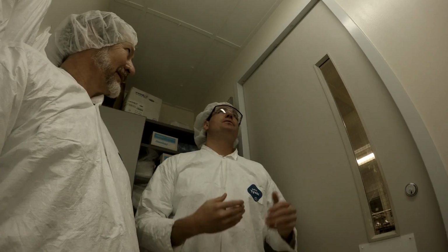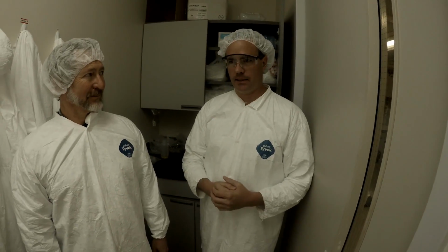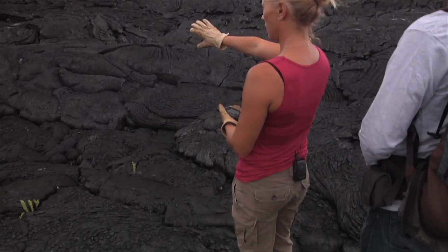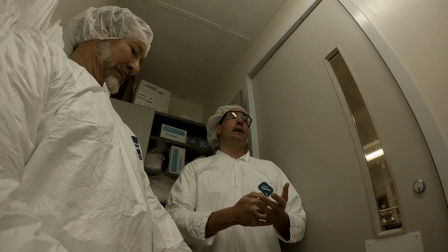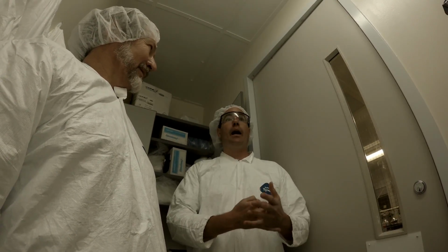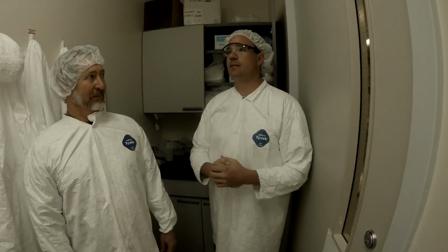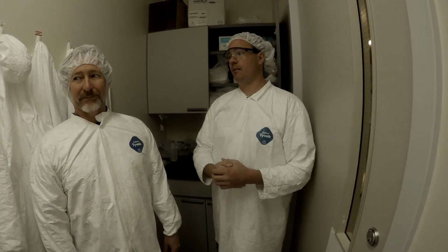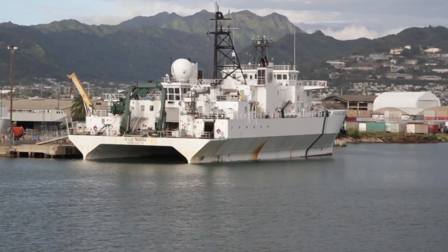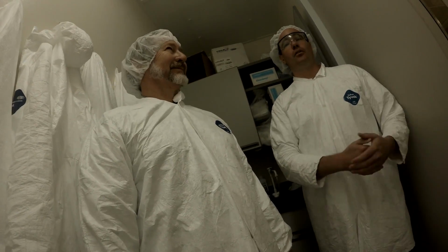And why do we need to keep it clean? We look at elements in rocks and other geological materials like seawater that are present in part per billion level quantities. If you're looking at something that's a major rock forming element, like magnesium, you don't have to worry about contamination. You could do that science on the counter in your kitchen and not worry about contaminating it. But if you're looking at something like lead or iron or mercury in seawater, you have to be very, very careful. It's very difficult even to collect them because you're collecting them from a metal vessel. So once you get to this part, you don't want to introduce any contamination here if you've managed to keep things clean all the way through.